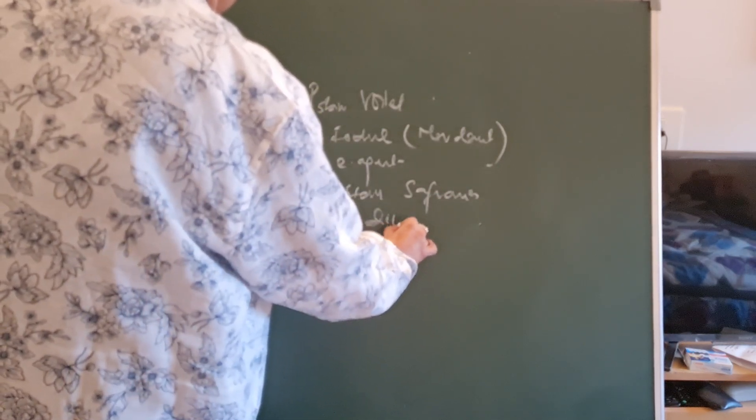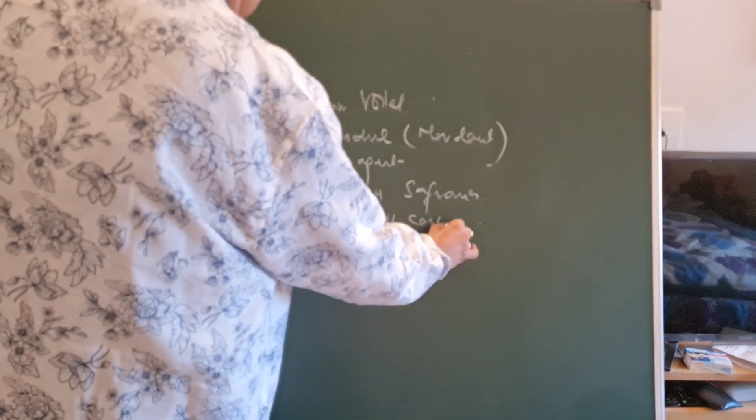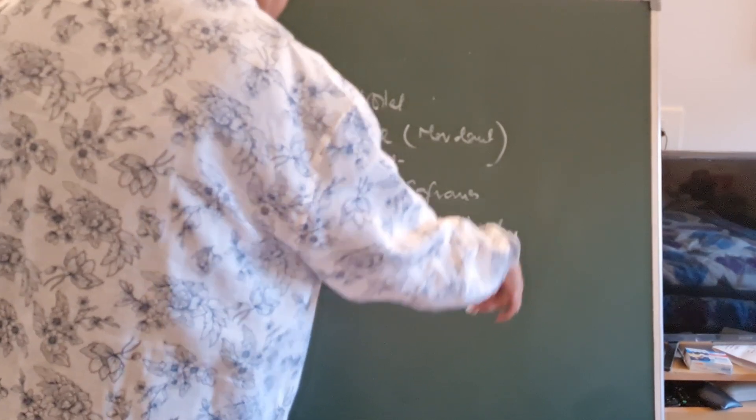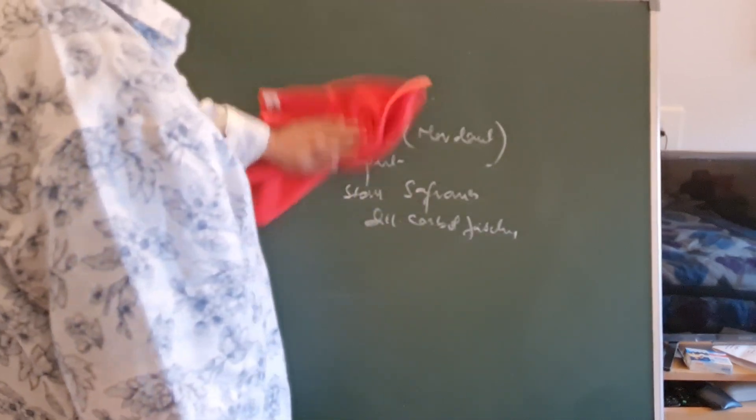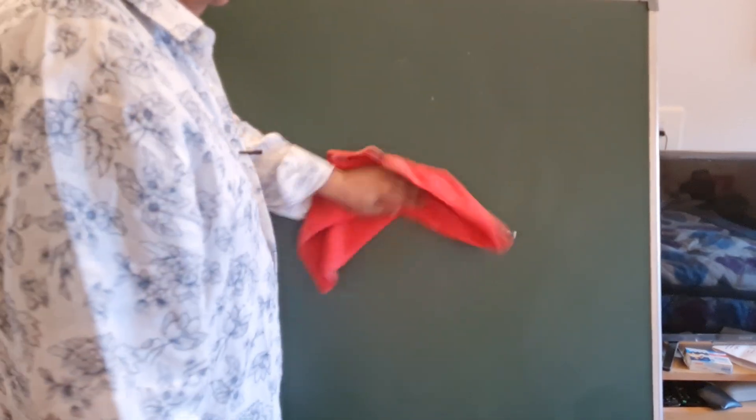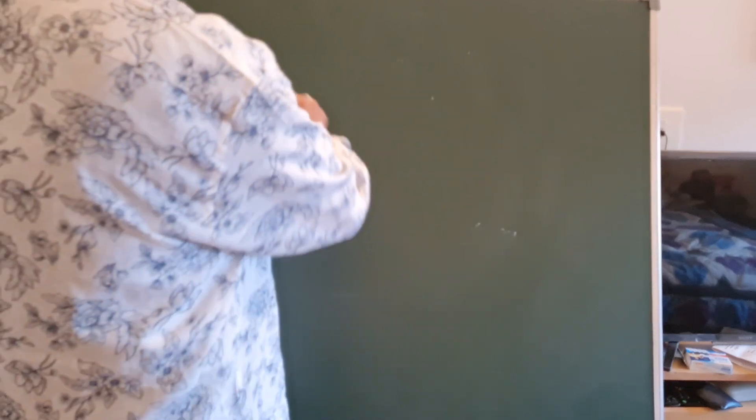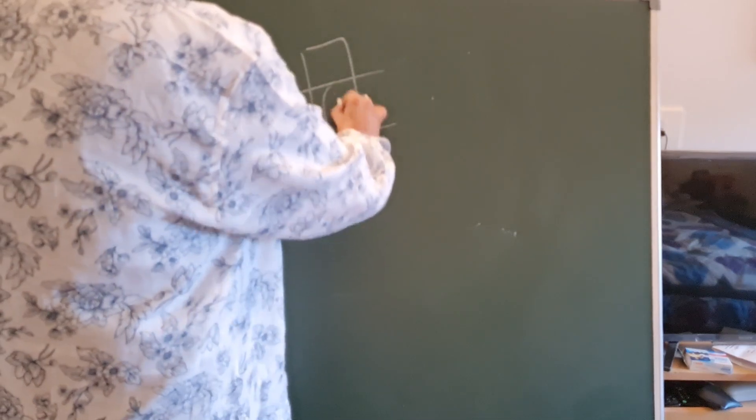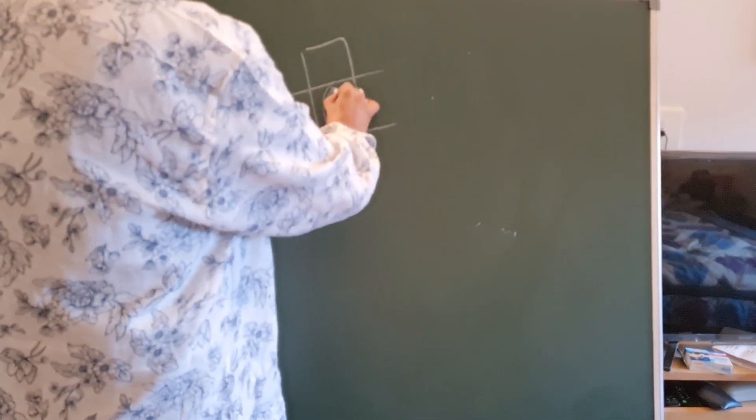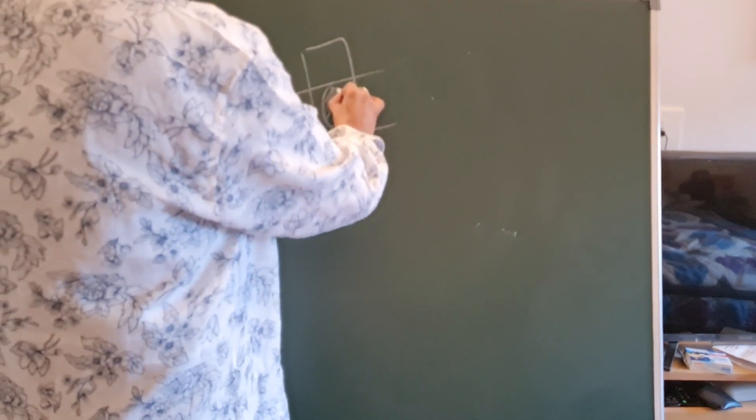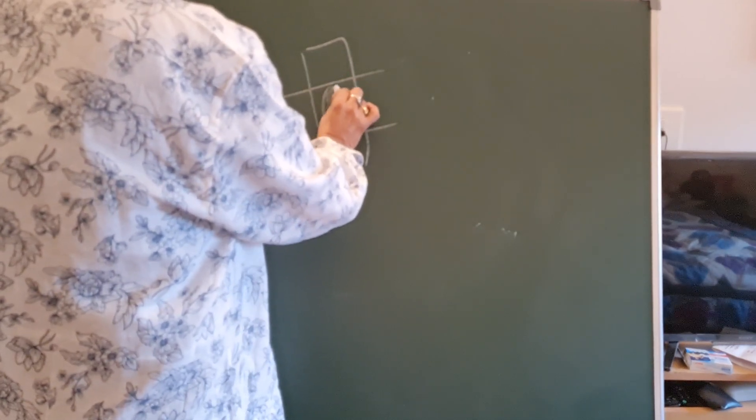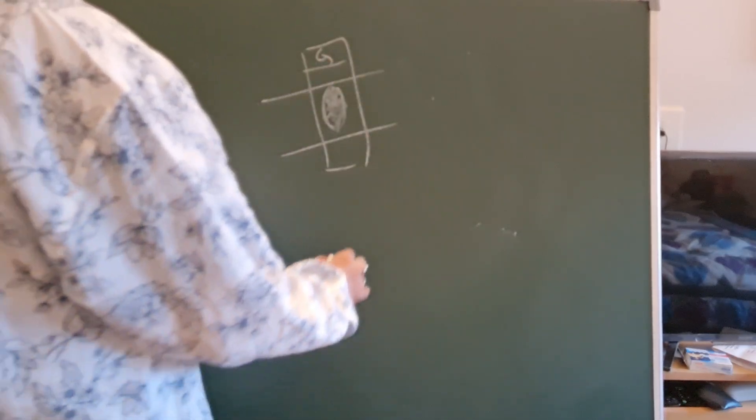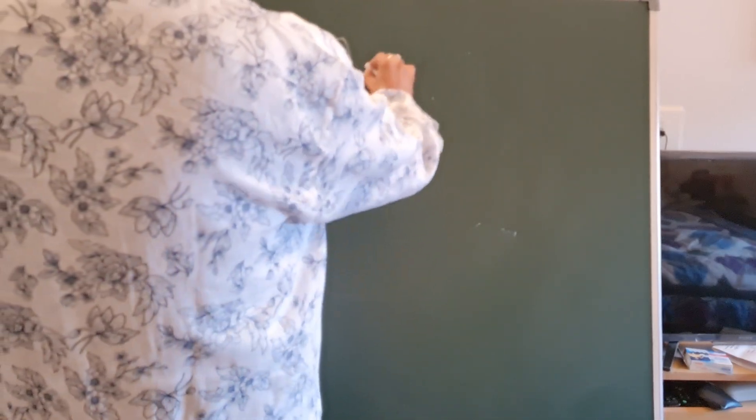Let us start the procedure now. Keep the smear on the staining rack, smear facing upwards. The most common mistake students do in the examination is staining on the reverse side, so make sure that you stain on the proper side.